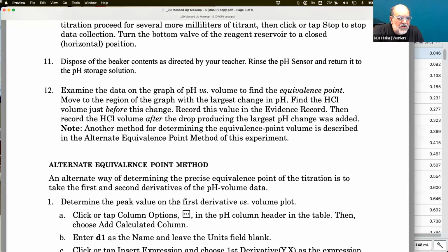Do you have a brand of makeup? No. What I did, Rajiv, is I bought a bottle of makeup remover, dumped it out, and put sodium hydroxide in it. I wanted the bottle to say makeup remover, but frankly, it's not really makeup remover. It's a little bit of artistic license there. So what you might do is find someone who has a container that's almost empty. I have three daughters, so I would have no trouble doing that. And then clean the container out and put your stuff in there. But no, no particular brand.